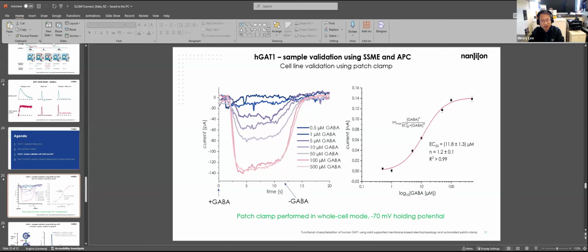I'm wondering, in your assay, can you look at a population of transporters? If you have some normal functioning transporters, but some are mutant, can you tease out that difference? And if you have, for example, a gene therapy situation where I replace a functioning transporter, will you be able to use this method to tease out the difference and the recovery?